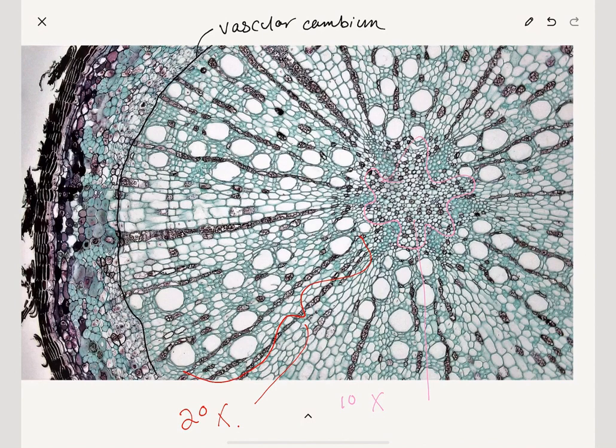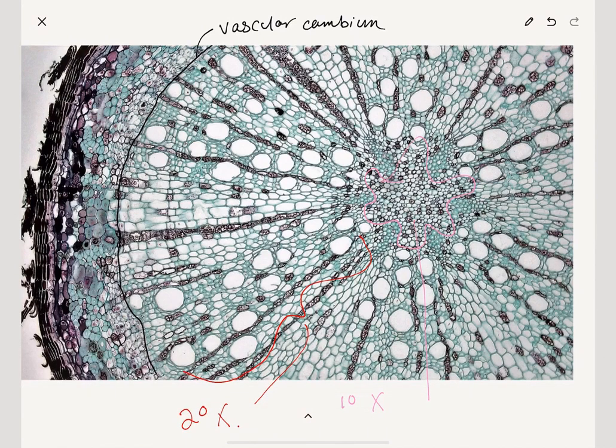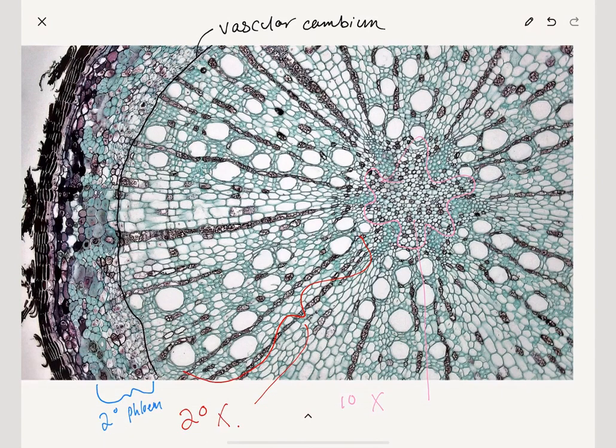First, we've got our secondary phloem, which I'm labeling here in this blue bracket. There are secondary phloem fibers mixed in. That's why there's sort of a bunch of different colors of cells and different looks of cells. We've got sieve tubes and their companion cells. We've also got fibers there. Just outside of the secondary phloem is where we'll first see the cork cambium.